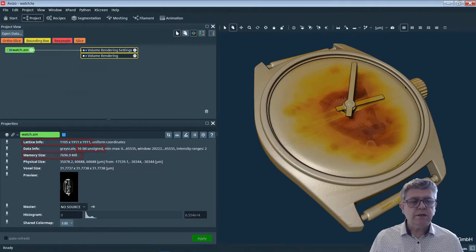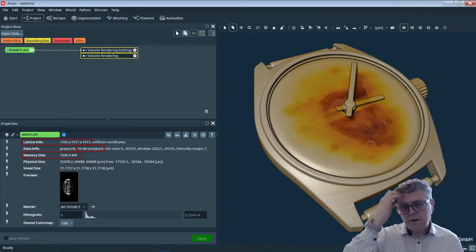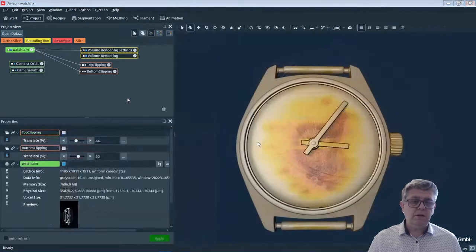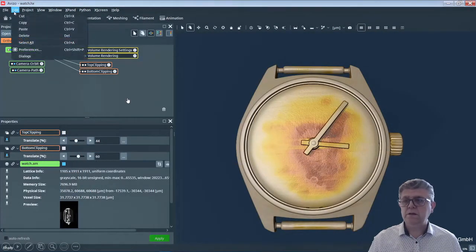So okay, this data set, how big is it? You see it's about 1000 by 2000 by 2000 roughly, 16-bit, meaning 8 gig. So it fits in my RAM, but not in my GPU. It's a good candidate. So we have to see how to work with the default settings, and then what happens if I modify the settings.